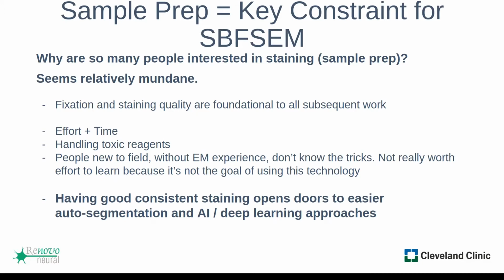So it often seems a bit ironic that one of the most challenging parts has been the low-tech sample preparation that has existed throughout the years, because the staining isn't actually difficult. It's just really labor intensive when you do it in a manual way. It's time consuming and you're handling toxic chemicals for hours. So we were very excited to investigate an automated approach to sample staining and embedding, which reduces these factors potentially, which we looked into, and especially the human time factor.